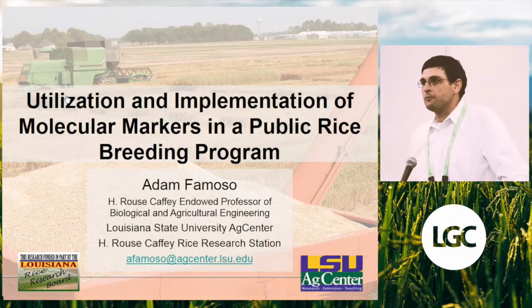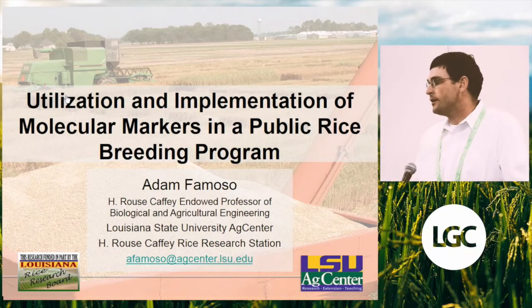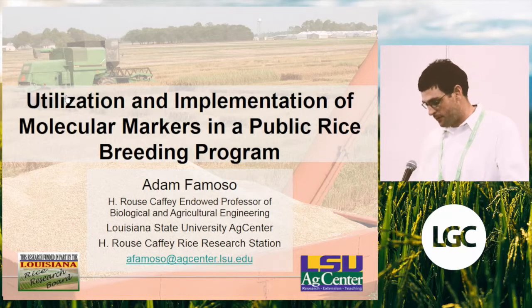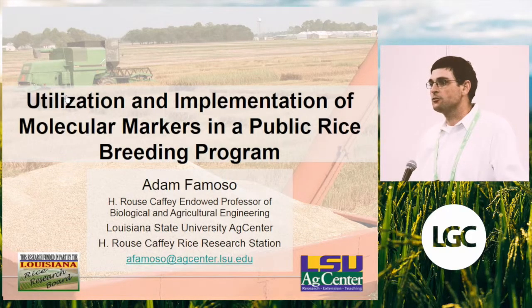Today I'll be talking about my breeding program at Louisiana State University. It's a rice breeding program, and in the last couple years we've started to move towards integrating molecular markers as a key component of these breeding activities. We've worked very closely with LGC setting up our lab, and we've come across a lot of challenges and hurdles during this process.